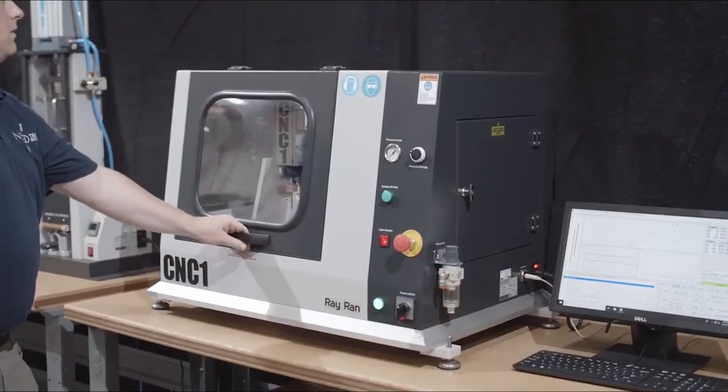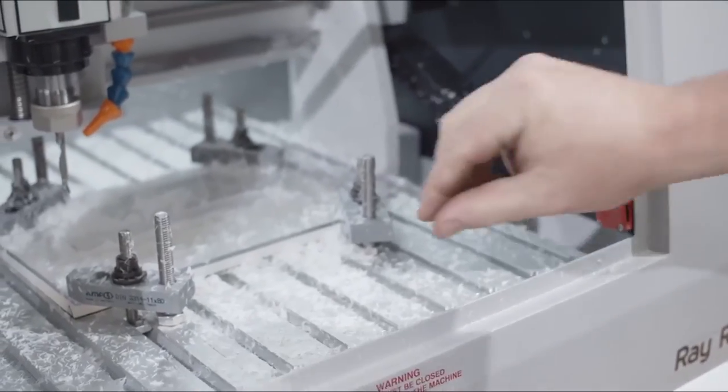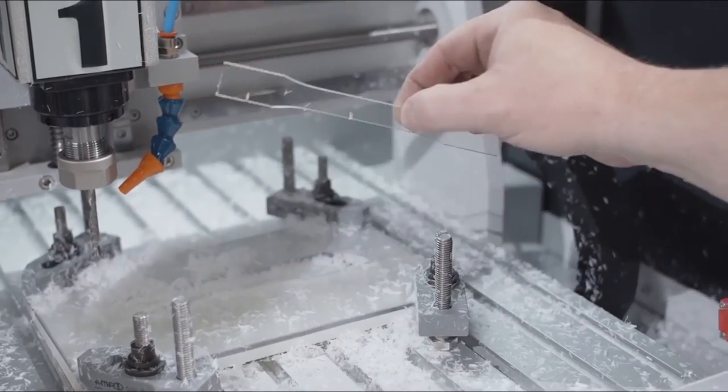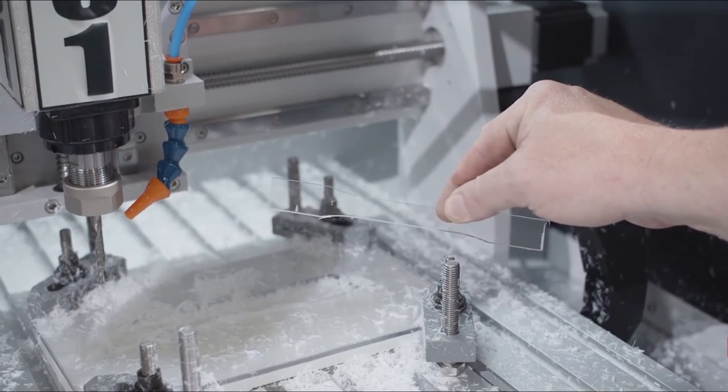Equipment from Rayran and United Testing Systems give your sample preparation a greater level of quality and precision. Visit our demonstration lab or learn more at unitedtesting.com.